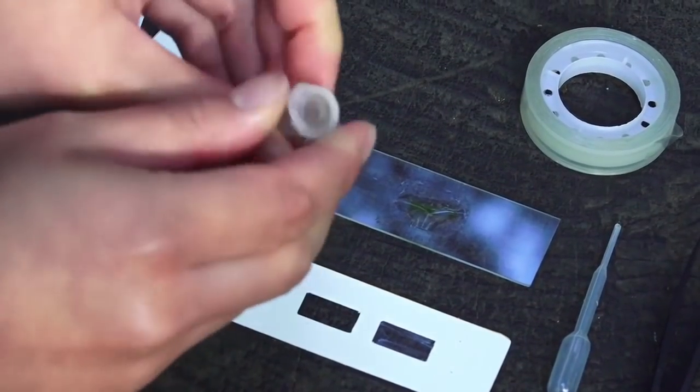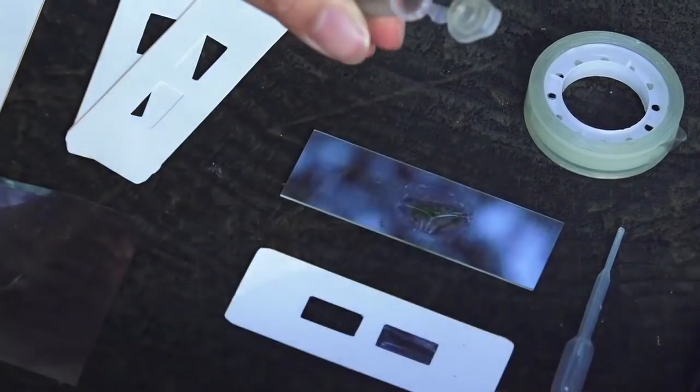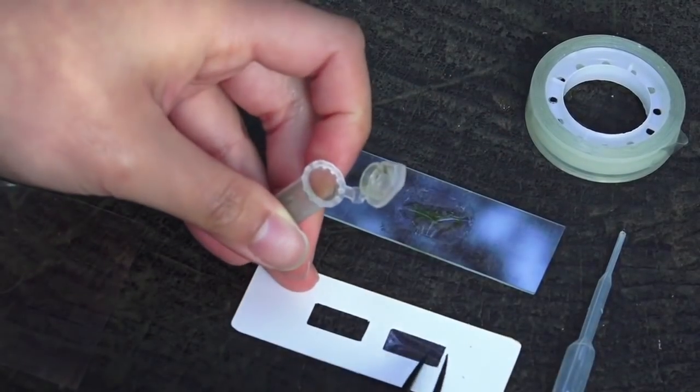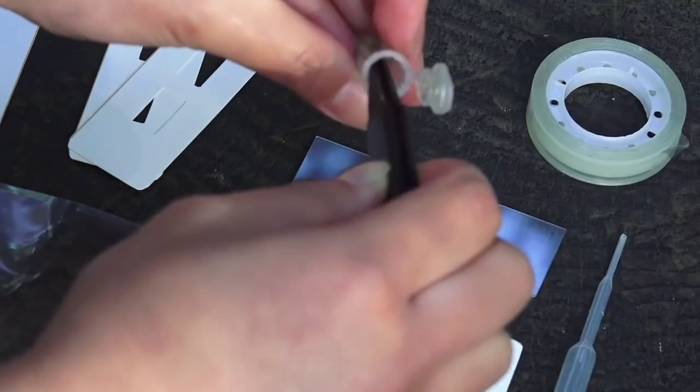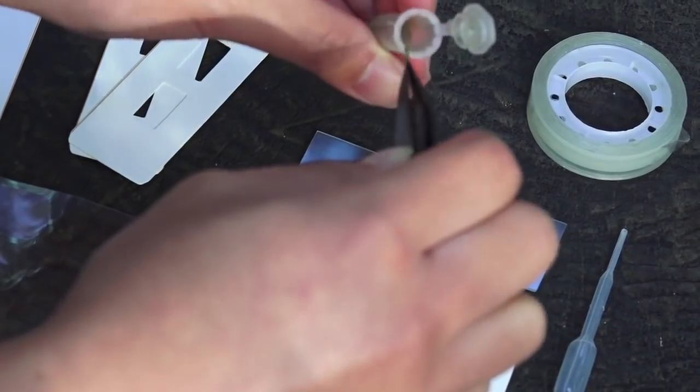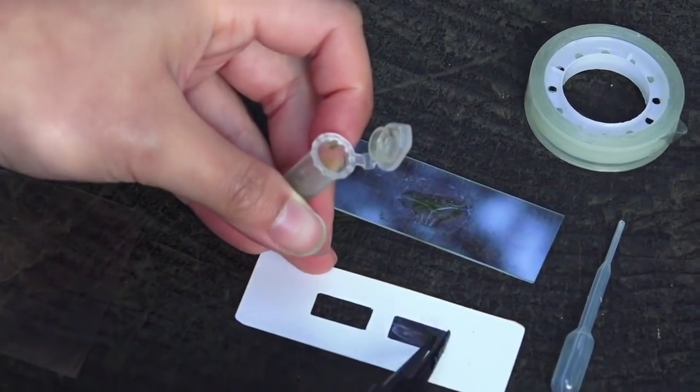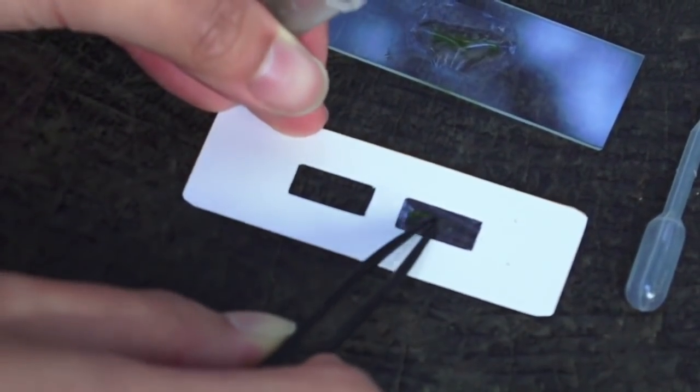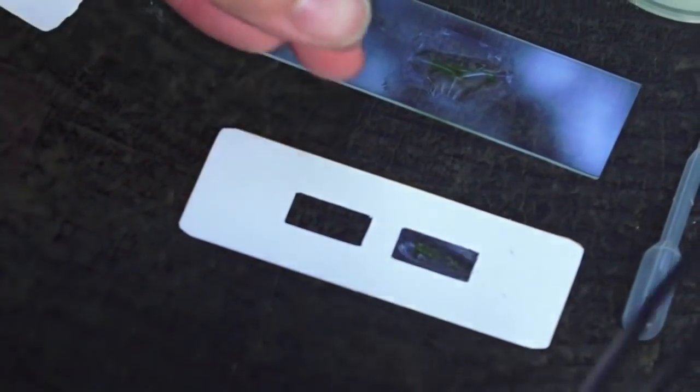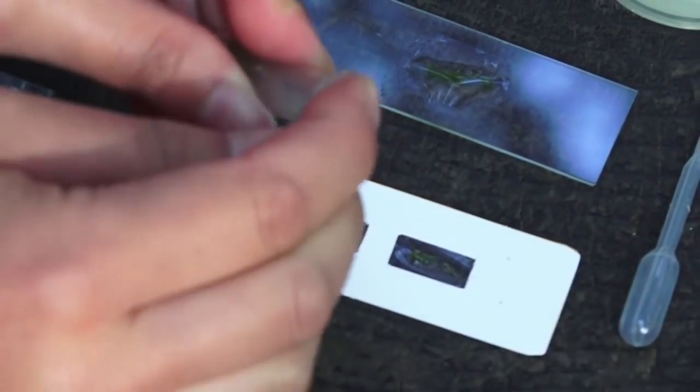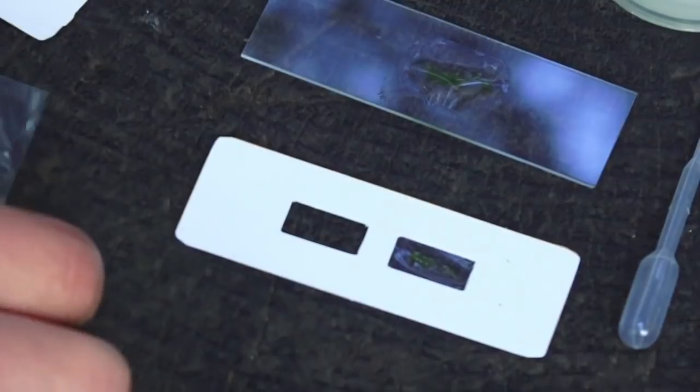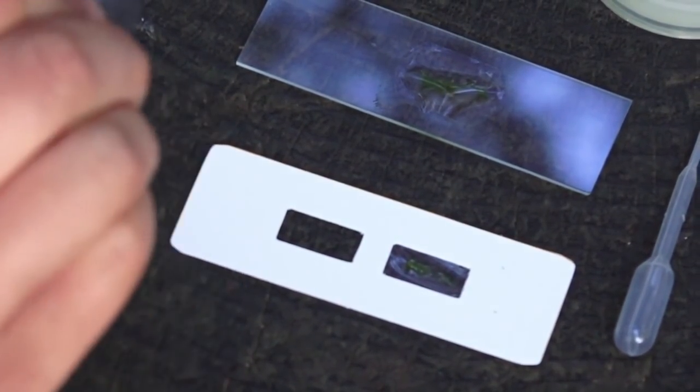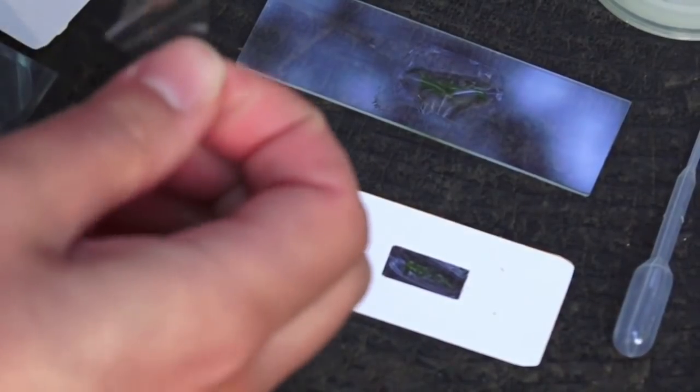Again place some samples that you have and this could be anything from leaves to some pond water sample. Just a tiny bit will give you a magnificent world to explore like that and then put another sticker over so that you're sandwiching your specimen with these stickers.